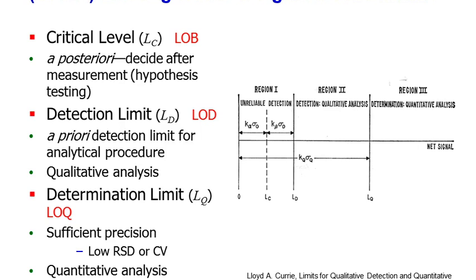How low can you go? There is a corresponding issue with going too high. I think Sue mentioned saturation and upper limits. So there are upper limits for systems, but I think those are a little easier to find, and the lower limits are what people are mostly worried about, because when you're running a cancer sample, in most cases you want to be able to measure the really low intensity or low abundance peptides. And so that is, I think, a bigger problem.